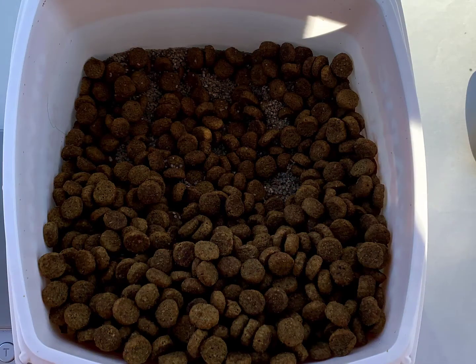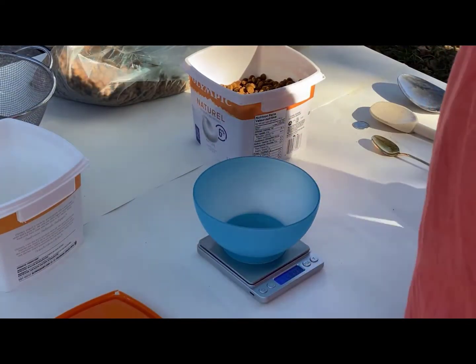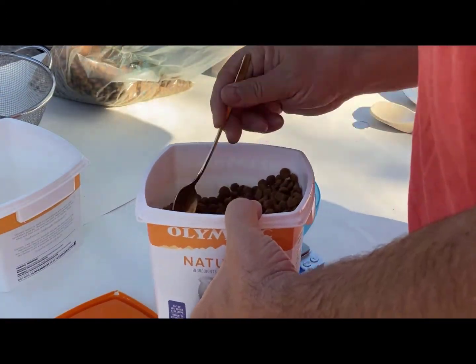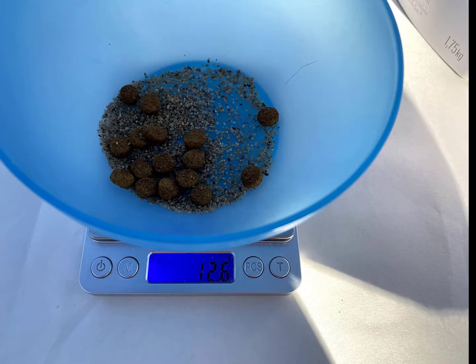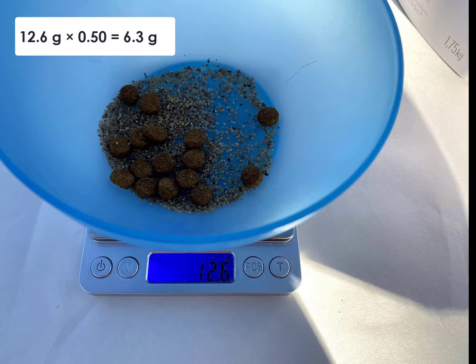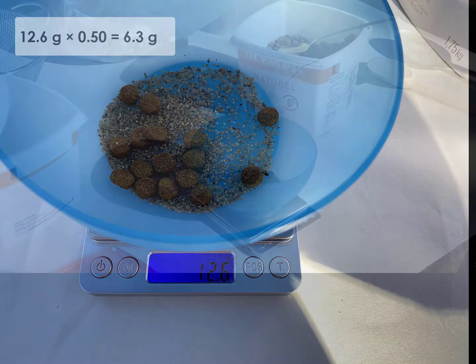If we take a sample from the bottom, we will likely have a lot more sand, and if we take a sample from the top, it will likely have a lot more kibble. I'll try to mix things around a bit and take a representative sample when I scoop samples out of our mixture. For this go-round, I will take one spoonful of the mixture using the small golden spoon. I have sampled some sand, some kibble, and the total mixture has a weight of 12.6g. Since we know that this is a 50-50 mixture by weight, we are expecting to have 6.3g of sand and 6.3g of kibble in this sample if we have a truly representative sample. Let's see how we did.